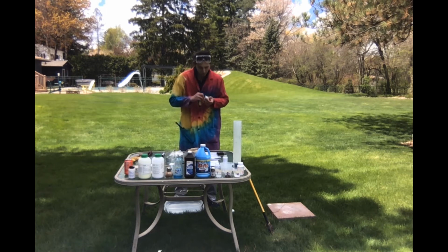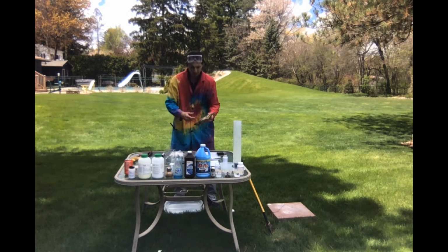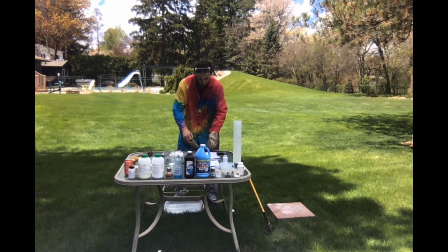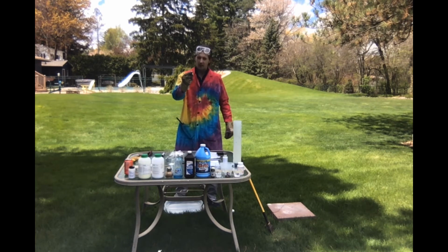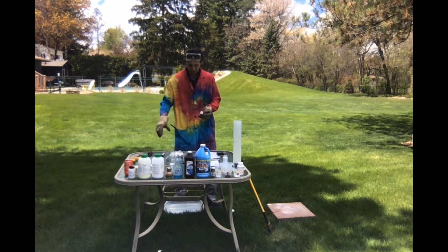So number 2, burning the cotton ball, all right? Since I'm dealing with fire, you gotta get some safety gloves on. It's a white or purple-ish cotton ball, and I'm going to add some flame to it, okay?